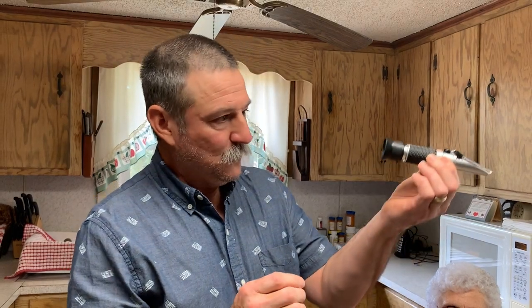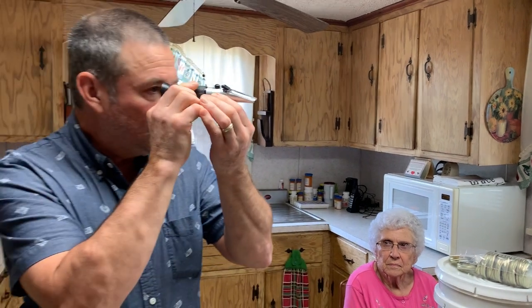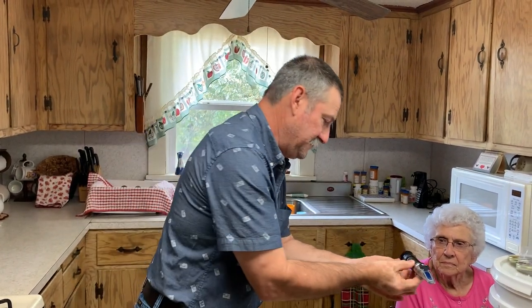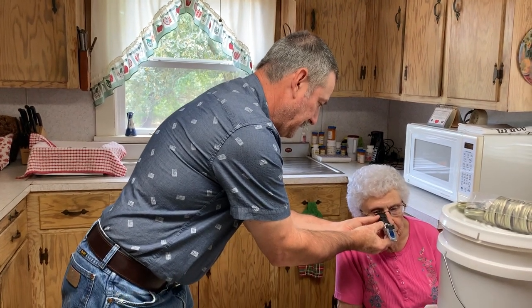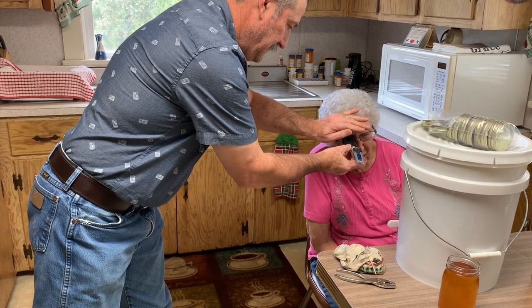I would like to hold this refractometer up. This is just a shot in the dark, and I don't know if it will even show this, but it would be great if it would. Now, I'm interfering with the camera operator. Yep, and where the blue line is, there are 18. Maybe Jason can make this look right. So that's what you just saw, what I see when I look into the refractometer. I call that 18. You may have to adjust the eyepiece. Oh, there it is. There, you got it.